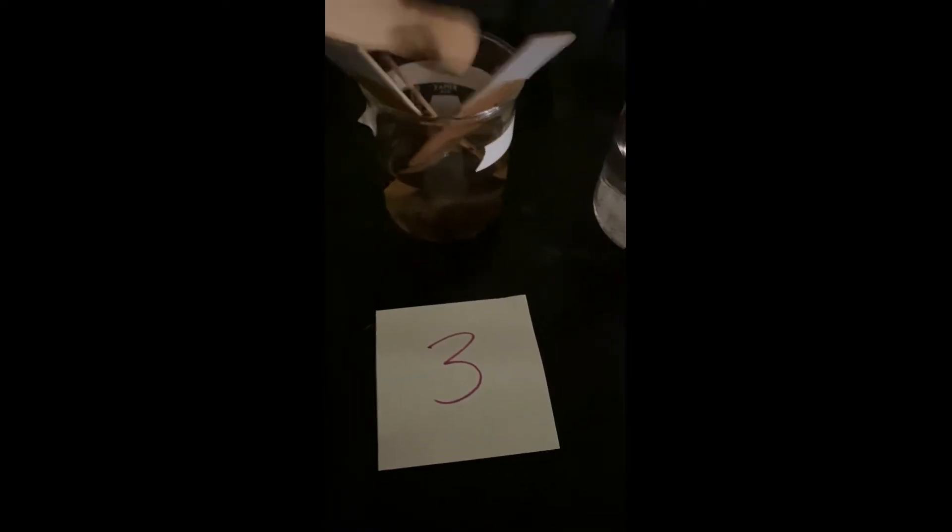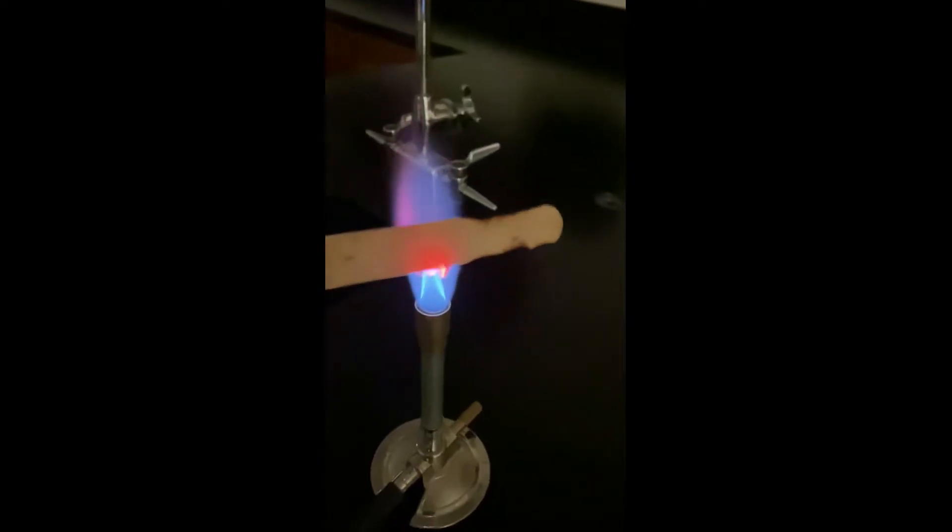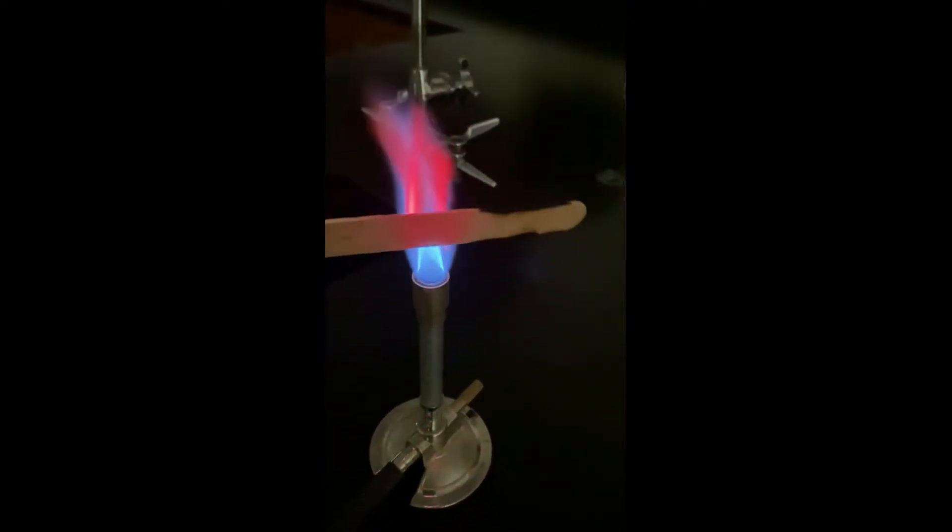You want to make sure that you adjust the gas until you see that blue color. If you are working with a yellow flame, go ahead and adjust your gas flow until you can get that blue. It's going to work much better.